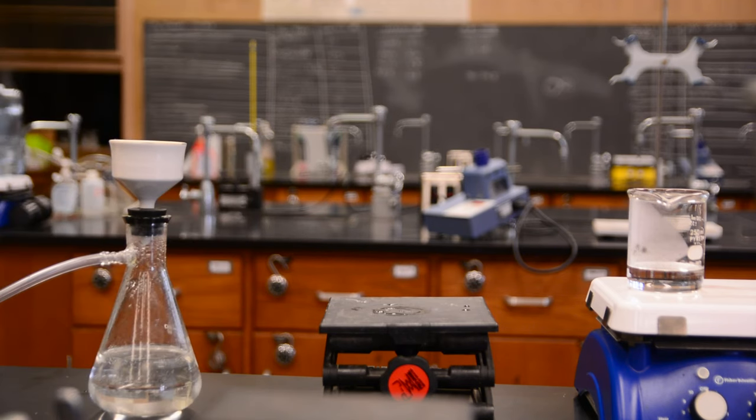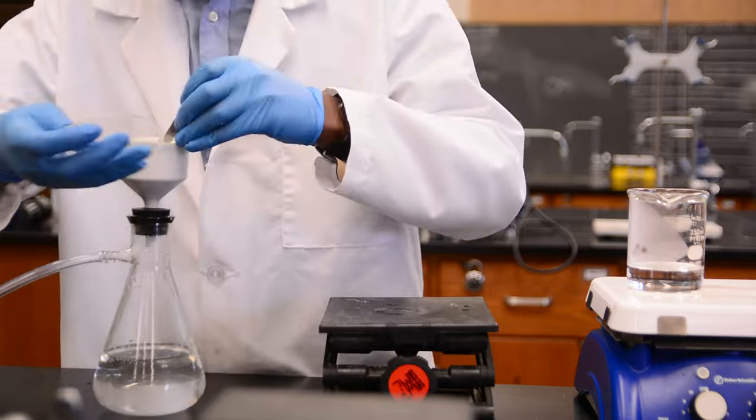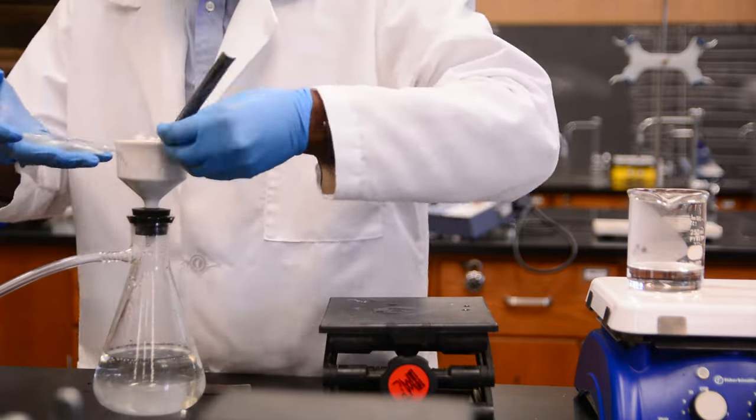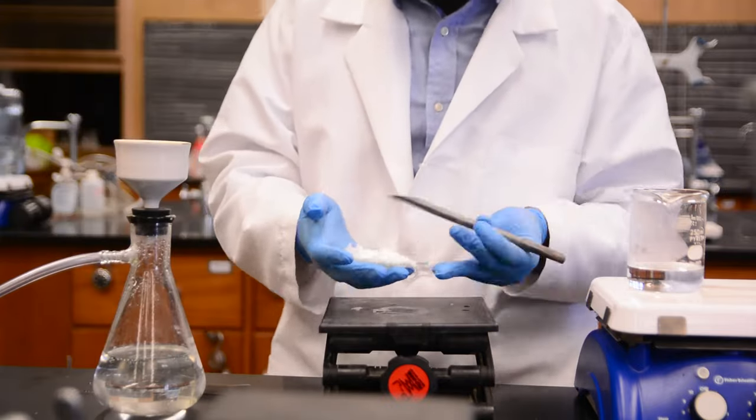After this, let the vacuum run for a few minutes to further dry your product. Your product should now be almost dry. You can leave it out to air dry at room temperature or put it in the oven. You have now completed a recrystallization.